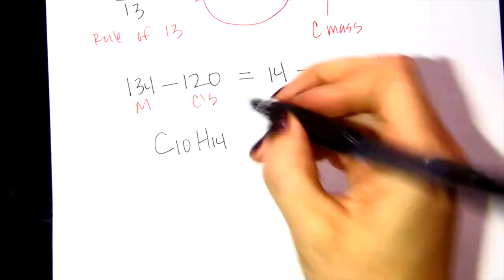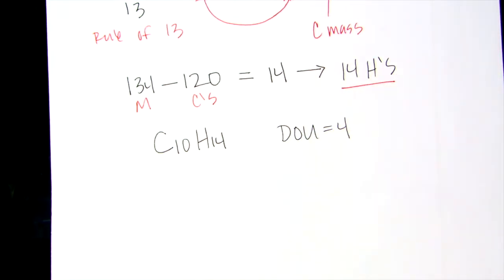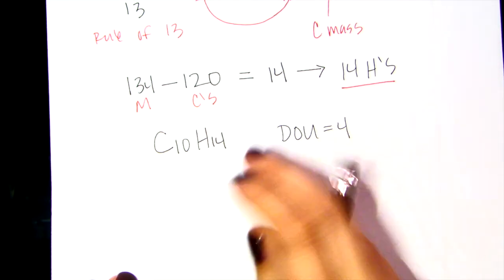Yeah, it's 4 again. Yeah, so it gives us a DOU of 4, so that's reasonable. So we can go ahead, and I think in this problem it's asking us again to propose a possible structure.